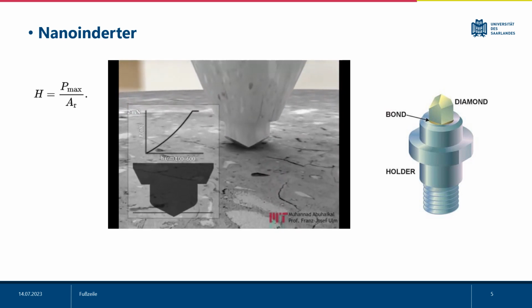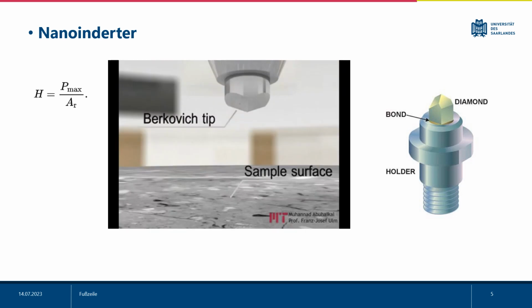The working principle of the nanoindenter is based on measuring the force exerted by the indenter on the material surface and the depth of the trace. The relationship between the force and indentation depth is analyzed by mathematical models used to calculate the mechanical properties of the material. In this way, properties of the material such as elastic behavior, plastic deformation behavior, surface hardness, and modulus of elasticity can be determined.